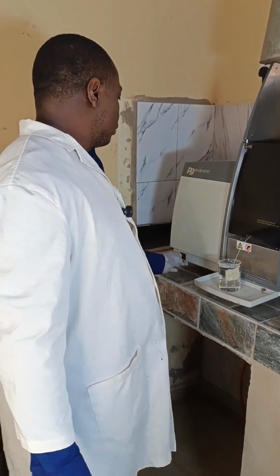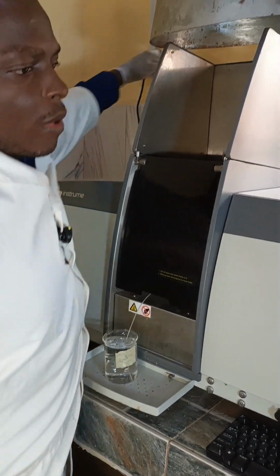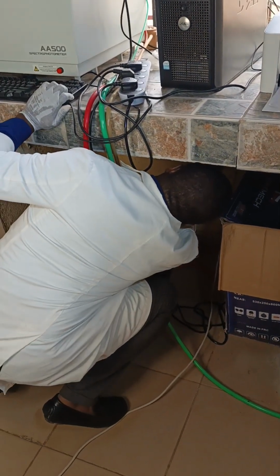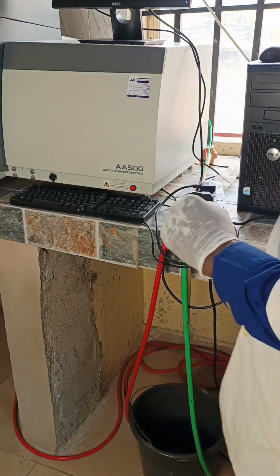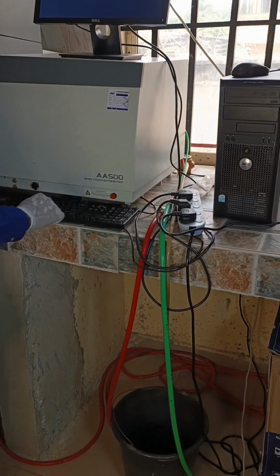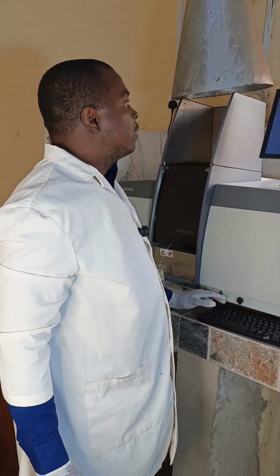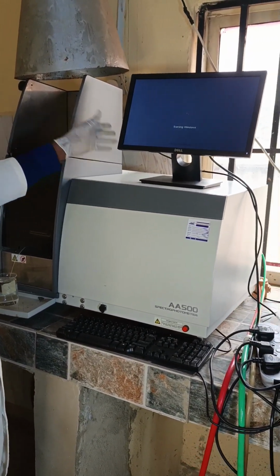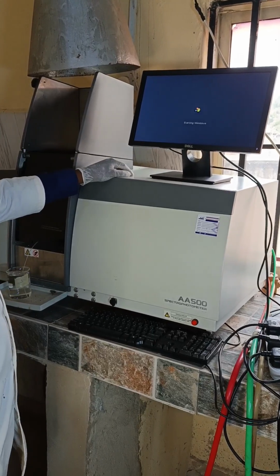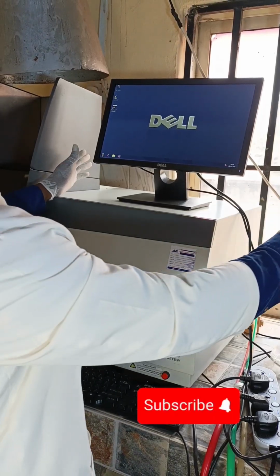turn the machine on. I have to ensure that, so now I can turn the machine on. As you can see, the machine is on. So I now go to the interface where the AA Win is coming up now. So as you can see, the AA Win is on.